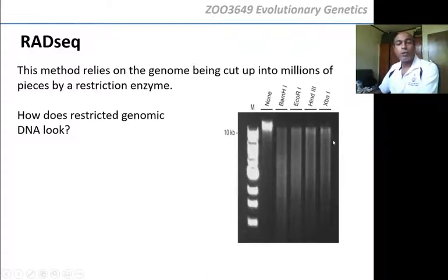Okay? So now, how do we know that our DNA is restricted? Look at lane number 1. It says M. M is for marker. Okay? It's a molecular weight marker. Basically, it's DNA of known size. This is not DNA we're interested in restricting. This is just to tell us what is the size of the other DNA that we have run in the gel. It is a marker.